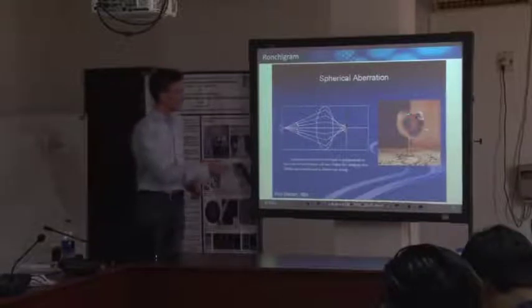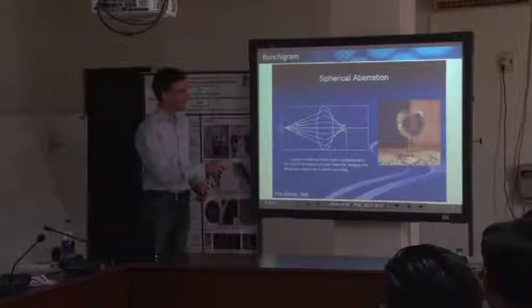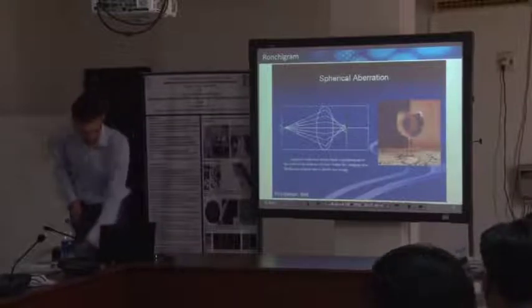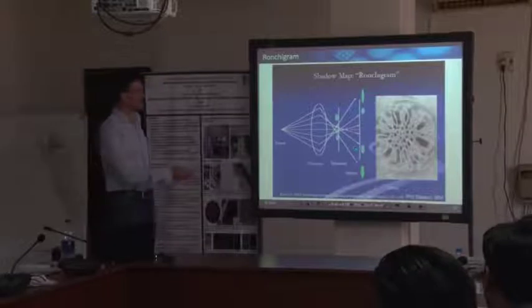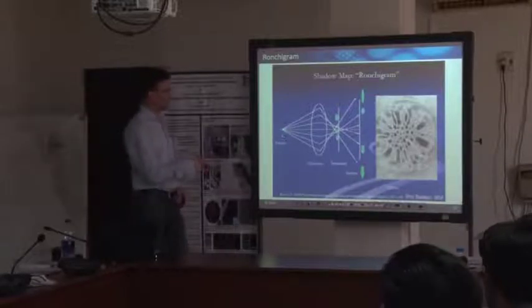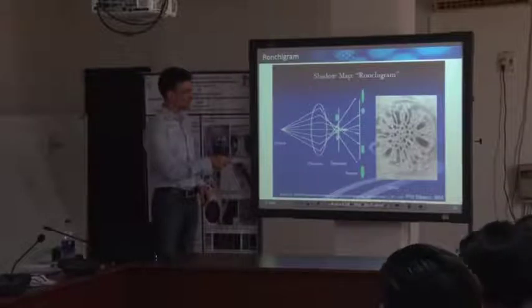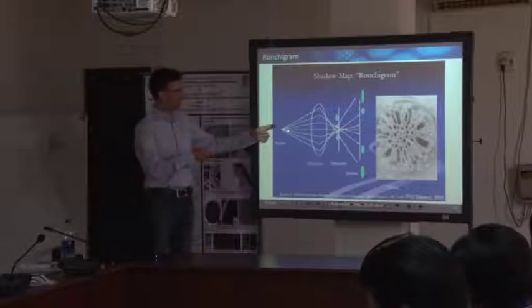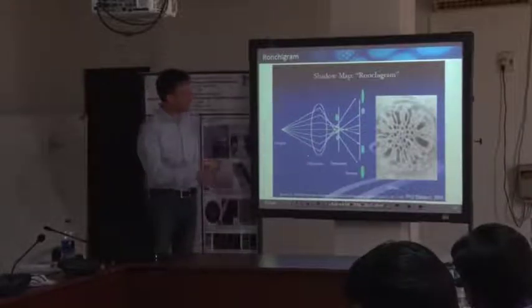And in these outer areas, we again see an image. So this is not inverted, and in these outer areas here, we get some inverted contrast due to these lens aberrations. And the same happens here. In principle, we have our electron beam, our lens. So this is our electron beam, which is not focused very well. These are all the electron paths that we accept by our aperture.